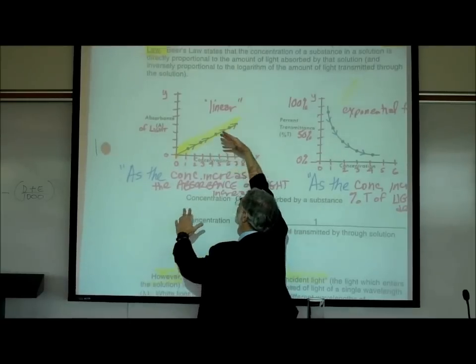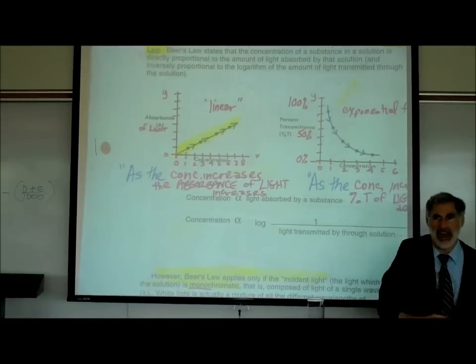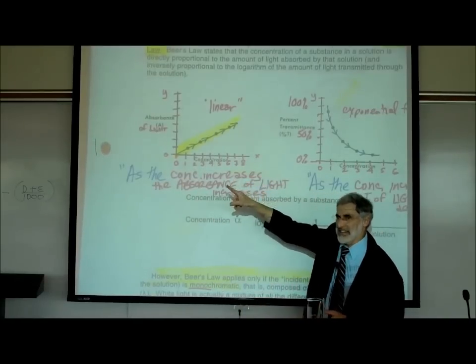Let's interpret this graph. How do we always begin when we are interpreting a graph? As the. And then we look at what's on the x-axis.